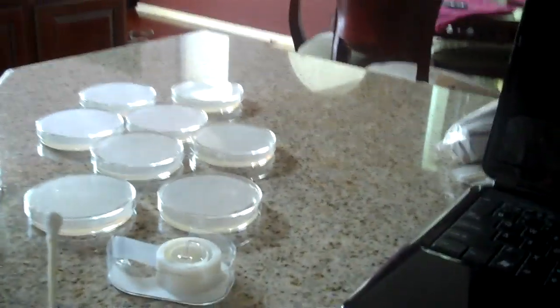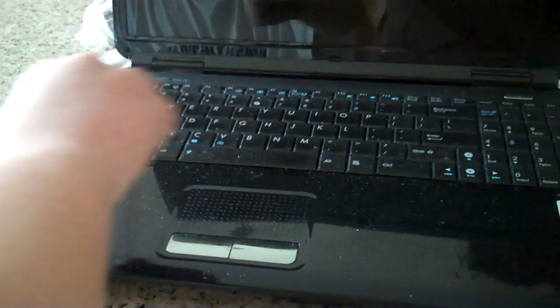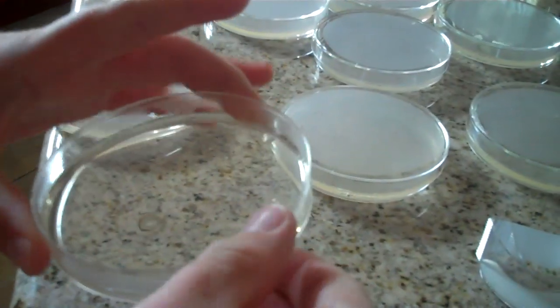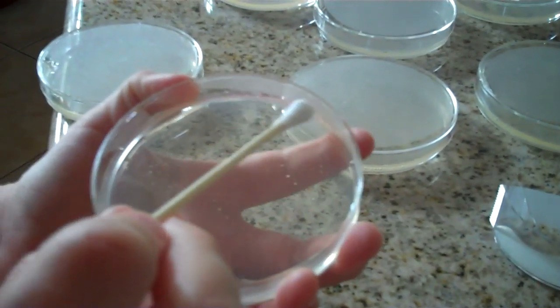Take one swab out and carefully swab a surface. Rotate the swab so all the surface is covered. Then remove the lid of the solidified agar and zigzag the swab over the agar, like so.